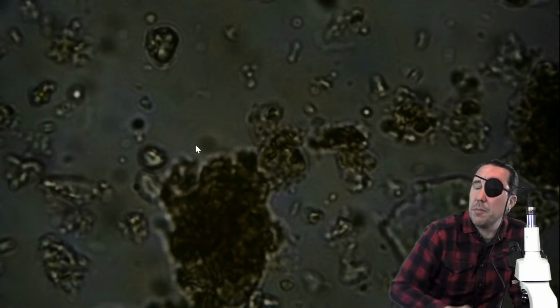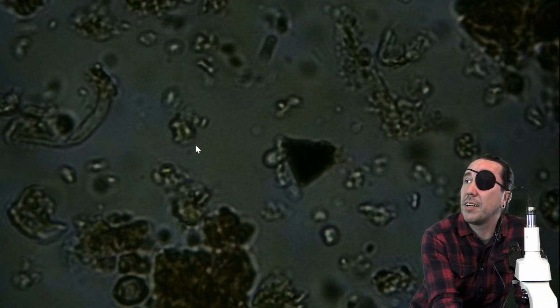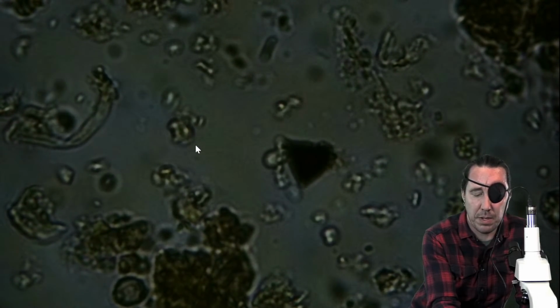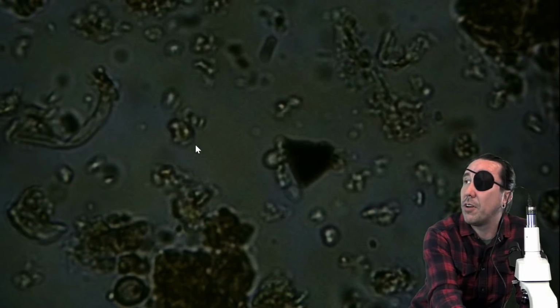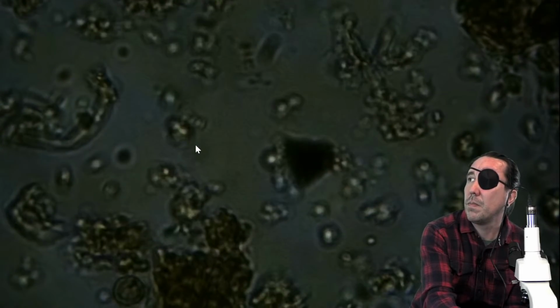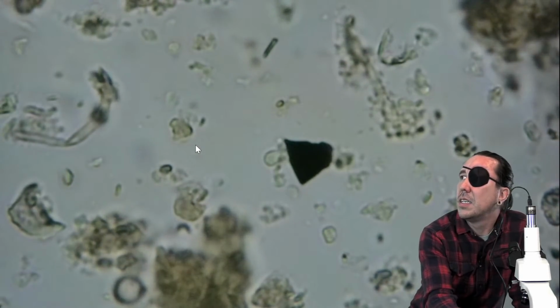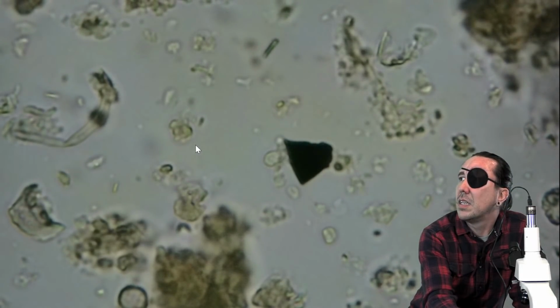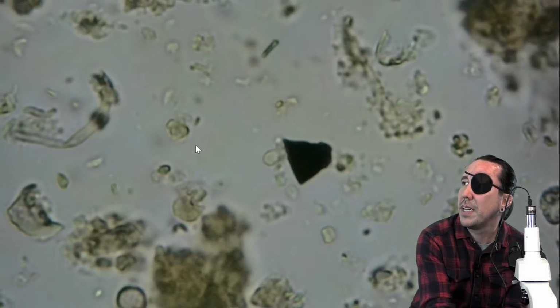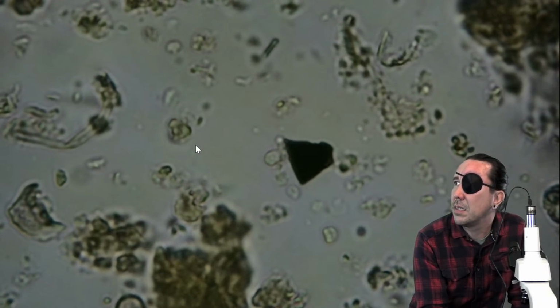Sorry, I'm going to move down to 400x. I told you I'm not thinking very well tonight. I was up at 40x. So we're at 400x. I'm going to pick a spot, look for amoeba, flagellates, fungi. I'm playing with my shadow and light here a little bit so that it's not so bright and we can see better.